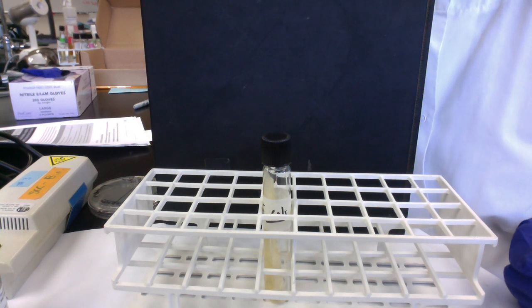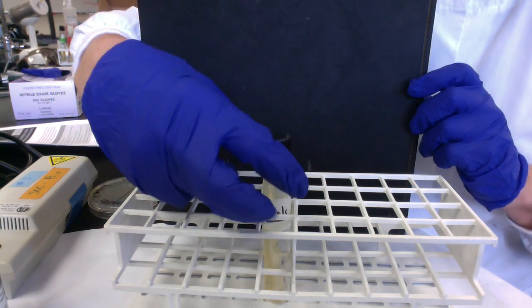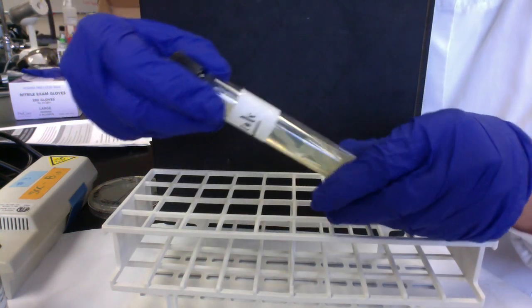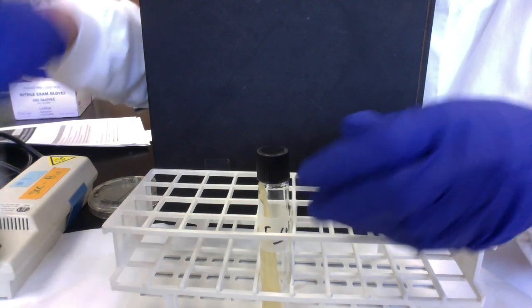So I was thinking there's a couple more movies I wanted to make. And on my way home, driving home, it bugged me that our catalase test was so weak. So my thought was maybe we could take our E. coli that we had previously streaked to an agar slant, and let me see if we can get a positive catalase test.